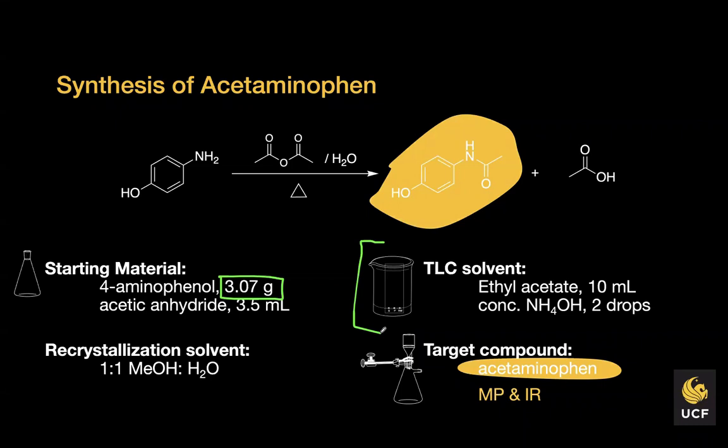We actually dissolved the recrystallized crystals in ethyl acetate. So the purpose was to see whether the product formed or not. It was one way for us to confirm based on our Rf values.